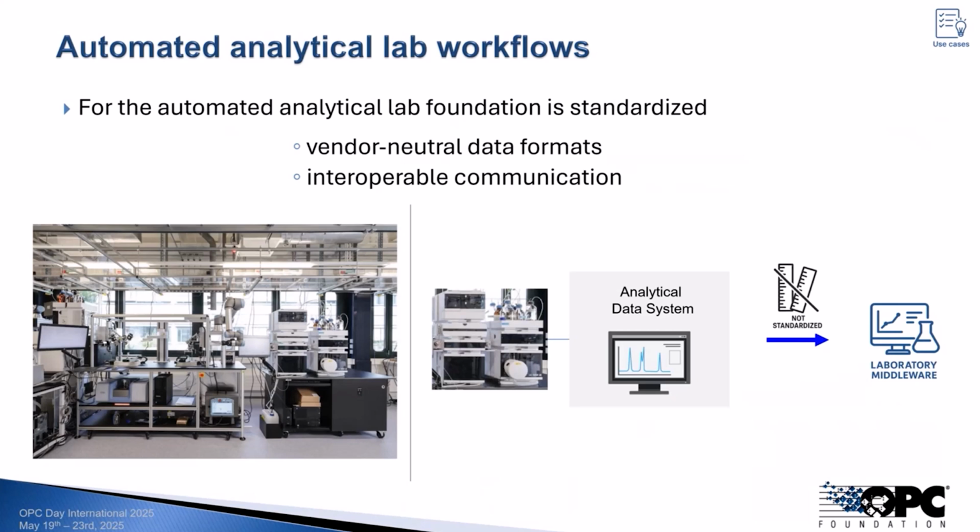For the automated analytical lab workflows, a set of devices has to be linked together. Linking means interoperable communication and data format. Both are not standardized today, and therefore there's a significant integration effort needed to link such systems together. To reduce the integration effort, vendor-neutral data formats and interoperable communication between the various systems is needed. This could be achieved by OPC UA and Allotrope Foundation standards.